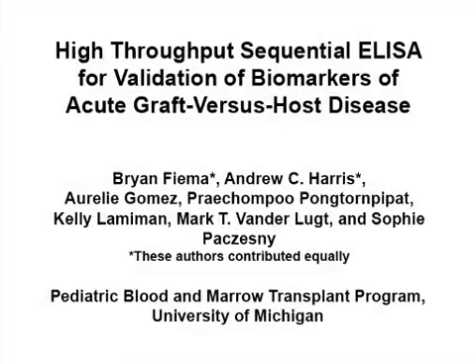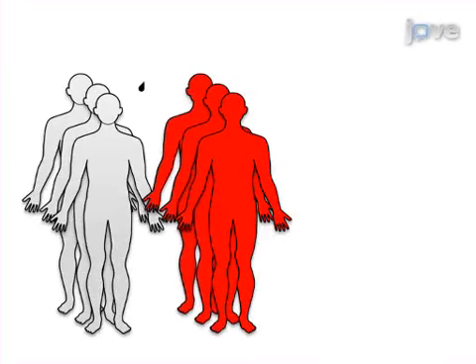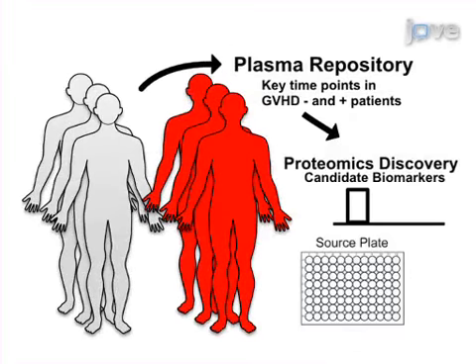The overall goal of the following experiment is to use high-throughput sequential ELISA in order to efficiently analyze large numbers of novel biomarkers that were discovered by proteomics. This is achieved by first adding samples to a source plate, which is used to create dilutions for each biomarker and to store recovered plasma between tests.